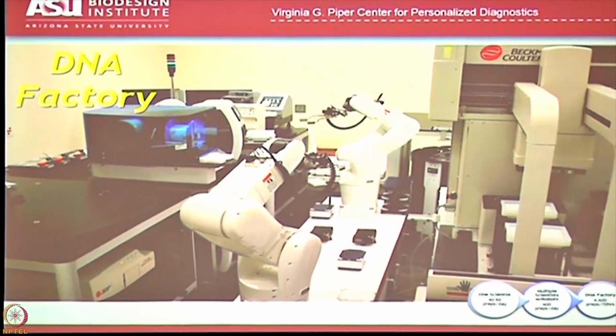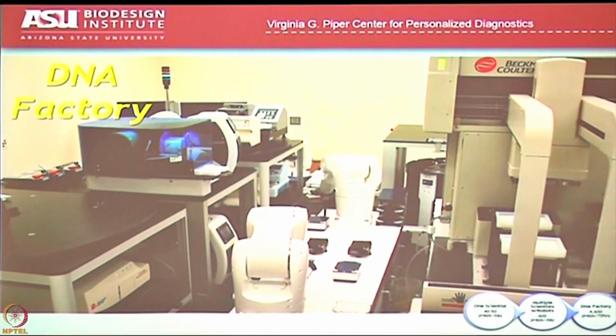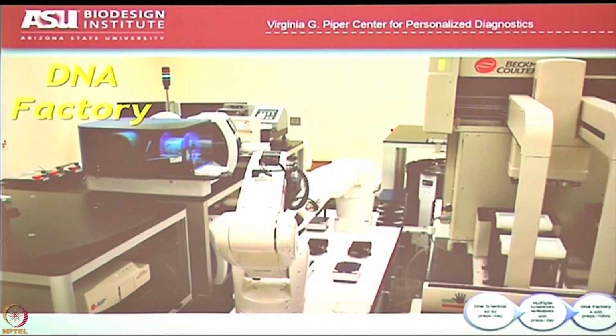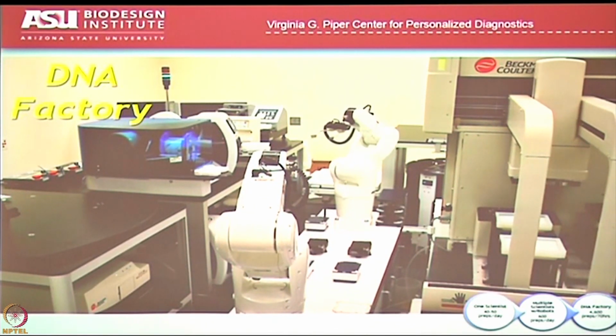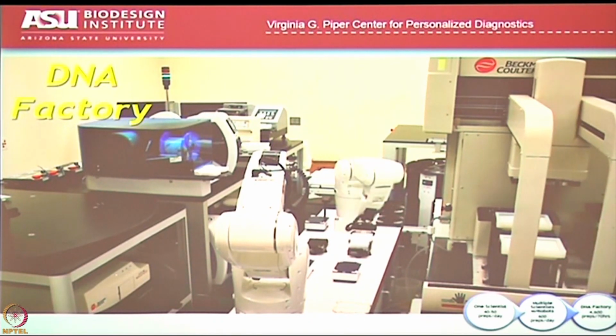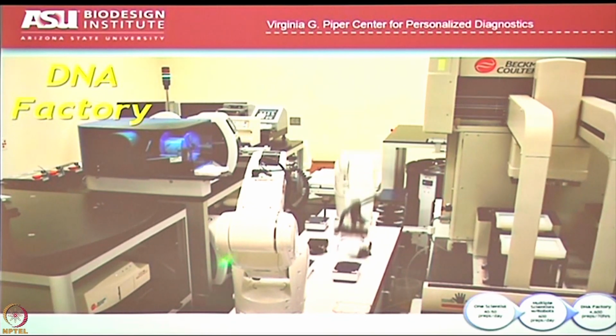And let me see if I can make this go. Is that going? Yeah. So this is what we have in Arizona now. In the basement where my lab is located, this is a fully automated platform for growing DNA and purifying it. The camera is sitting on an incubator shaker that grows the bacteria with the DNA in it. This particular shaker has a specialized door in the back so that these robot arms here can reach in and take out each one at a time as it needs to. And they pass it back and forth on that platform there.